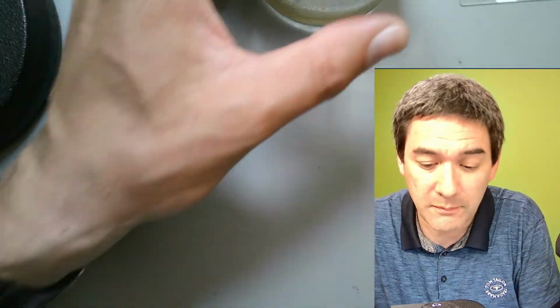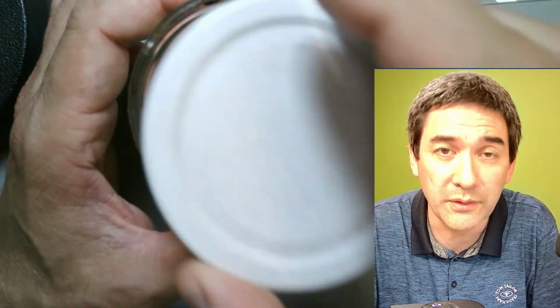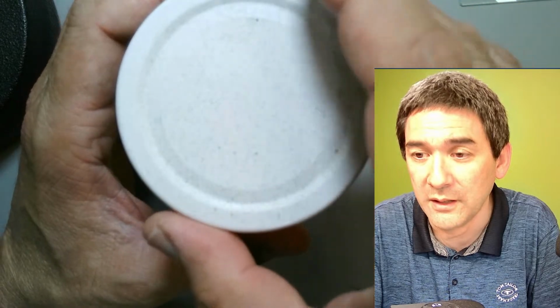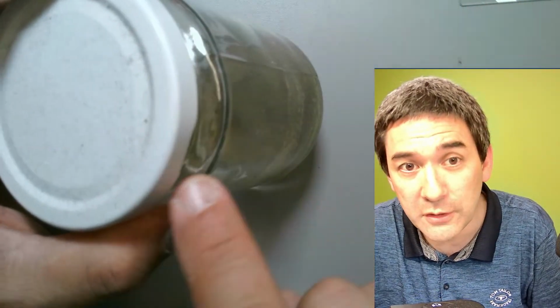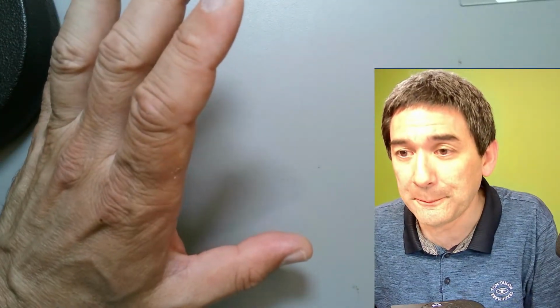So that's an important thing I would like to recommend. You can put a lid on top, but make sure there is plenty of air in there. So I want to move on a little bit.